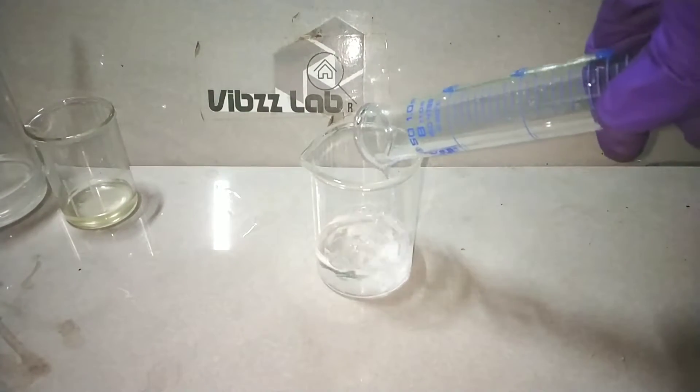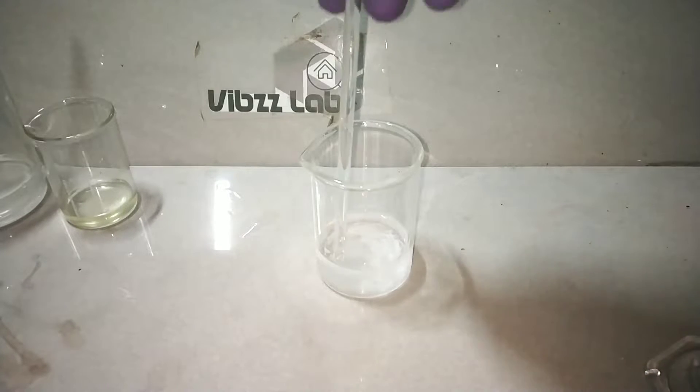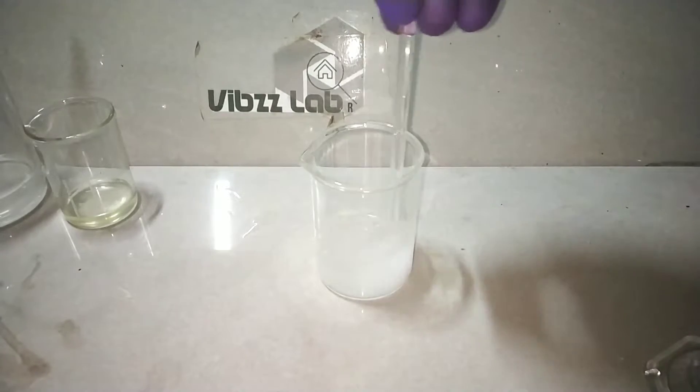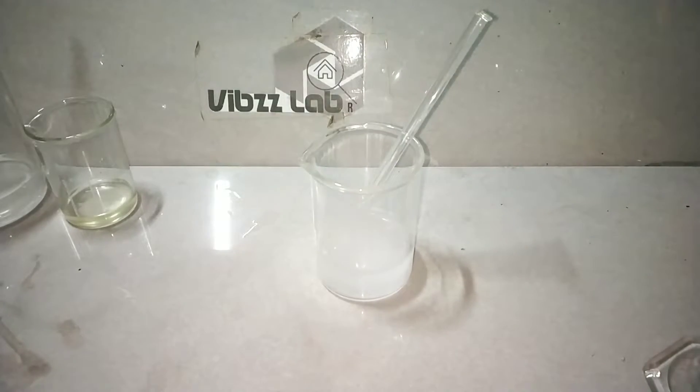After weighing out the sodium hydroxide, I added 25 ml of distilled water to it and dissolved the sodium hydroxide using a glass stirring rod. Dissolution of sodium hydroxide in water is exothermic, so take care not to spill the contents of the beaker.